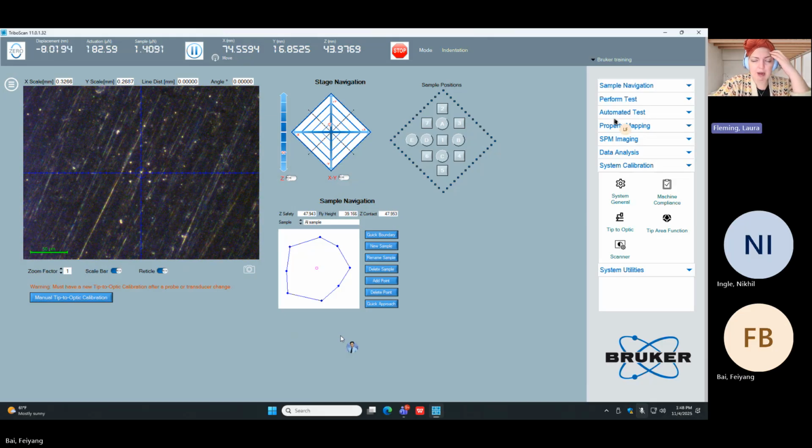So there is an additional step on the H pattern called closing the H, and it serves two purposes. One, to mark that this H has been used. It is not the H that you are looking for in the future. And two, to verify that you did get the correct H, because if the indent doesn't appear where it should appear, that means that something has gone wrong. So we like to put an extra indent either between the top two indents or the bottom two indents. I always go to the top. I'm not sure why. It's probably just how I was trained. But you can go ahead and put your reticle between those top two indents. I'll move the center. Yep, using the stage navigation.